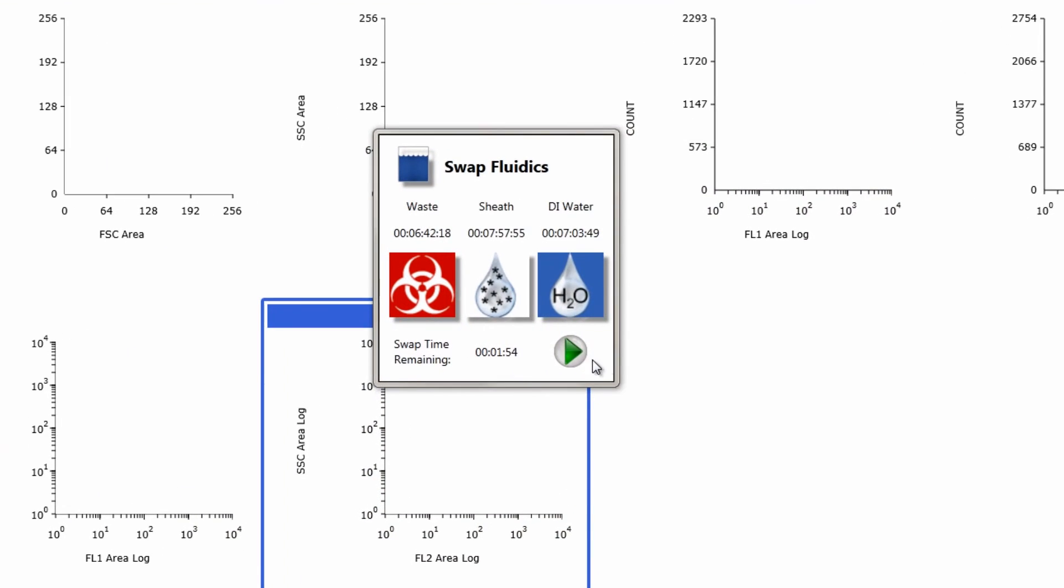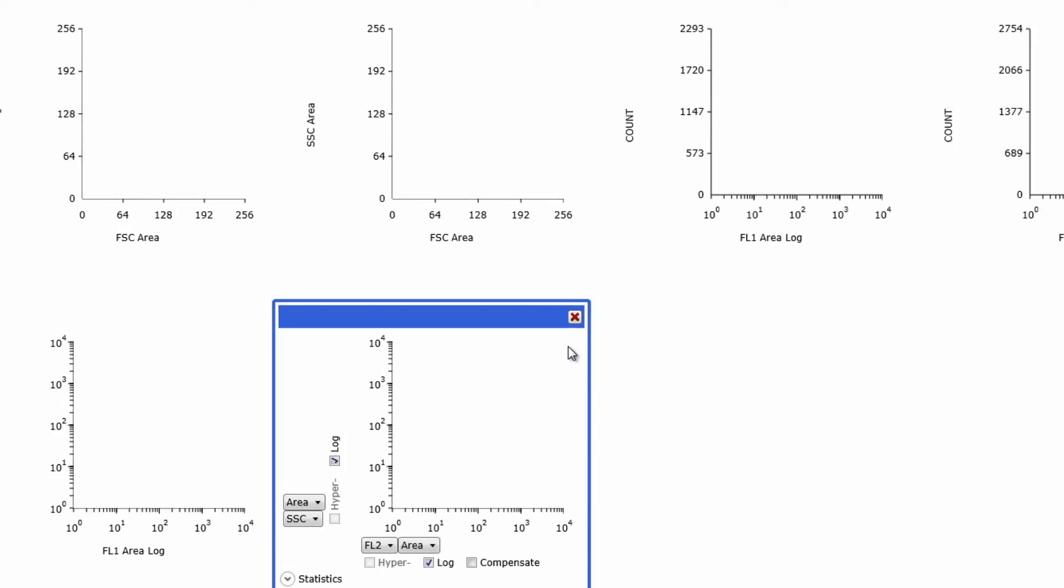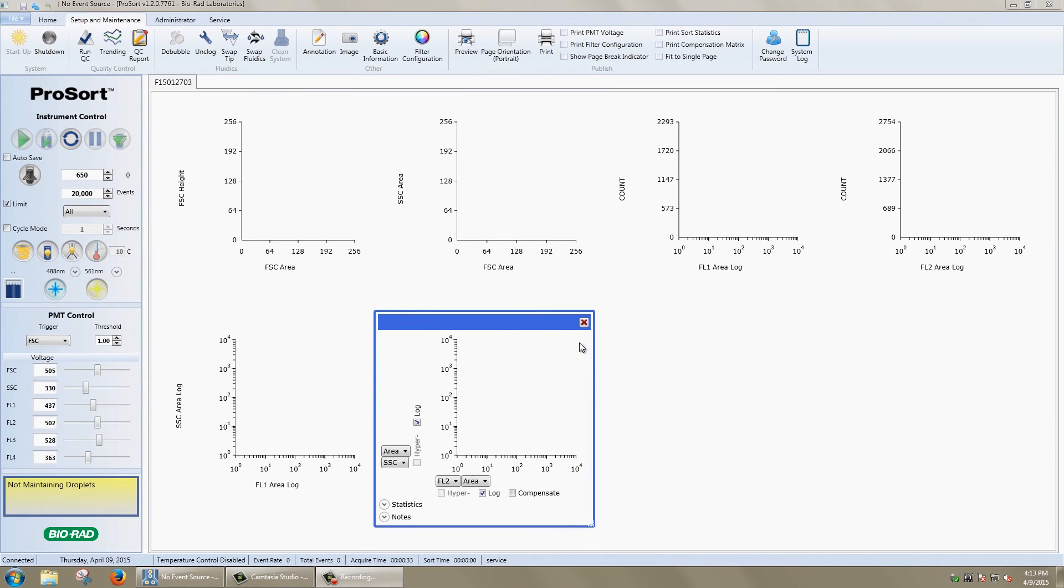Once all the bottles have been replaced, click the play button in the software's Swap Fluidics window to finish the swapping procedure and continue with your experiments.